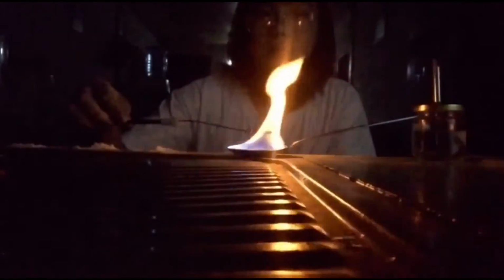So the first solute that I tested is the milk salt. As you can see, the color of the flame is burnt orange and a little bit yellowish.